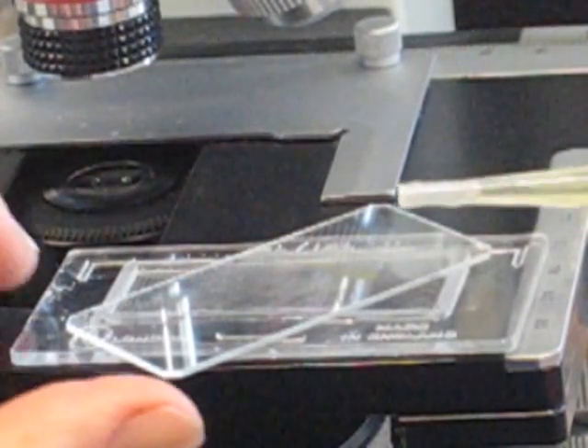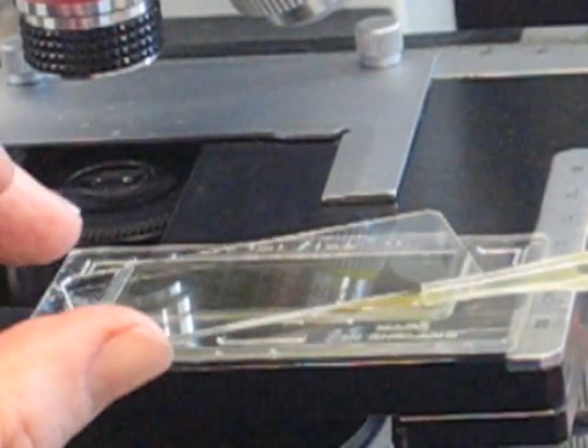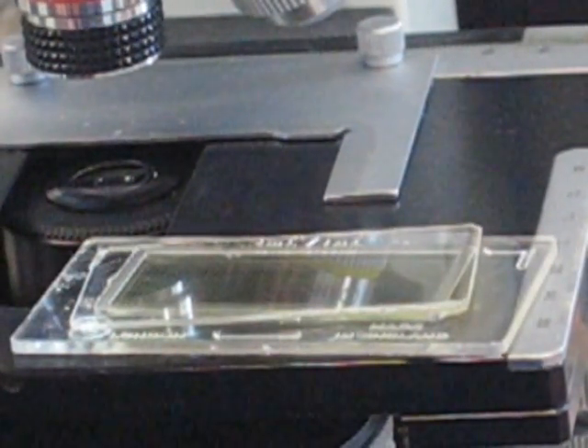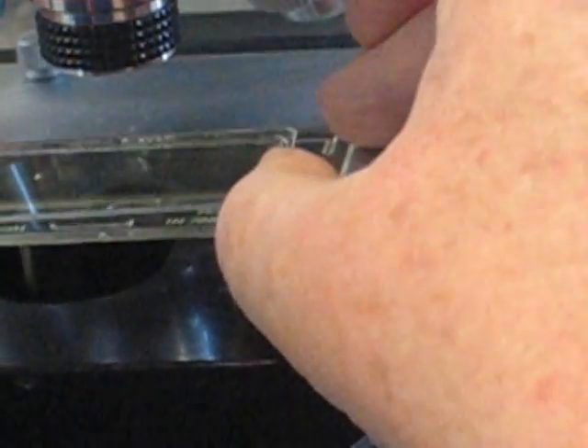If you don't have a glass pipette, no problem — a plastic one works just as well. Just squeeze it in again, keeping it nice and close to horizontal, squeeze in the corner, bring the top slide around, and put it to settle.